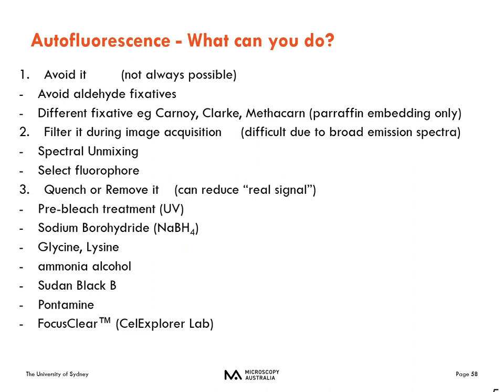What can we do with autofluorescence? First, of course, we try to avoid it, but it's not always possible. We can choose not to use aldehyde fixative, or use a different fixative to avoid glutaraldehyde. Here for light microscopy, we always recommend using paraformaldehyde 4% in different buffers. However, it's not always possible.